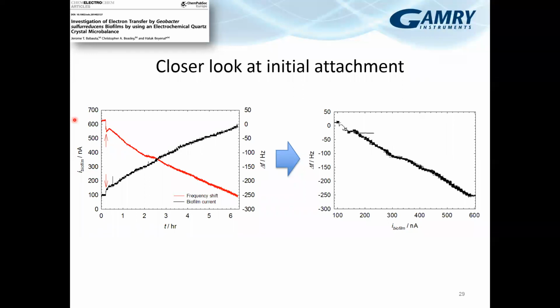If you're using other strains, for example, Shewanella oneidensis, you can use lactate, pyruvate, or basically any carbon source that the microbe will be able to metabolize. Yes, it just depends on the metabolism and what's known about the microbe.